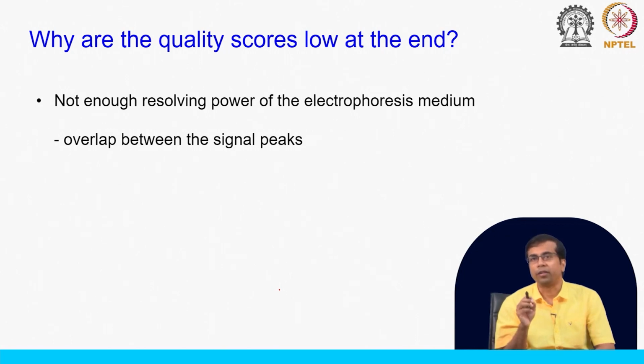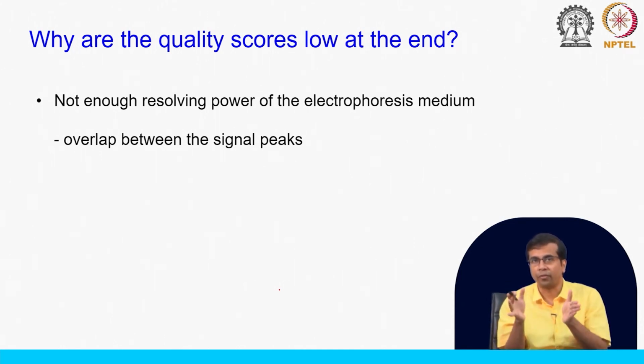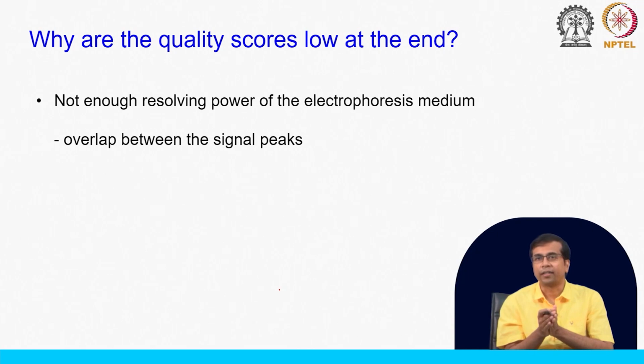What about the low quality score at the end? This is something we have seen. Again the resolution power comes into play, right. This electrophoretic medium has some optimal range, probably around 50 base pairs to 1 kb in length. Beyond that, the resolution is not very good.